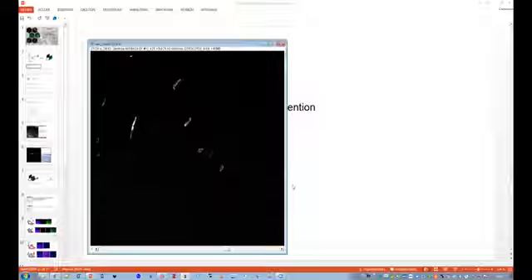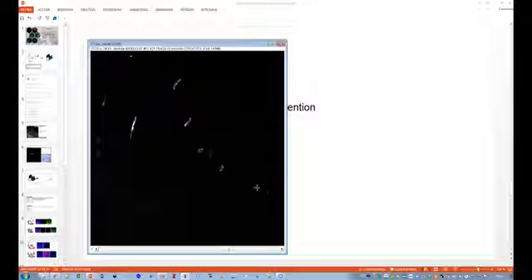You stack all the pixels of the image and you get the spectrum of that. Yeah, I stack all the selected pixels, pixels with threshold, and then I have the sum of the spectra of all the selected pixels. But of course, you can choose more selected pixels.